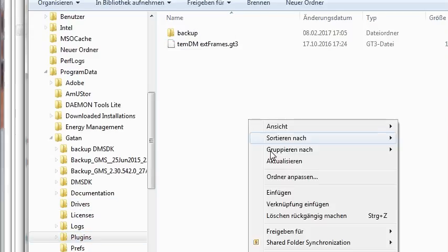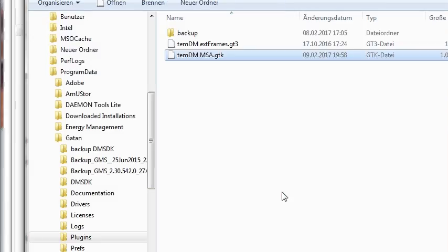Then just paste here this file. Well, installation is finished. Very simple.